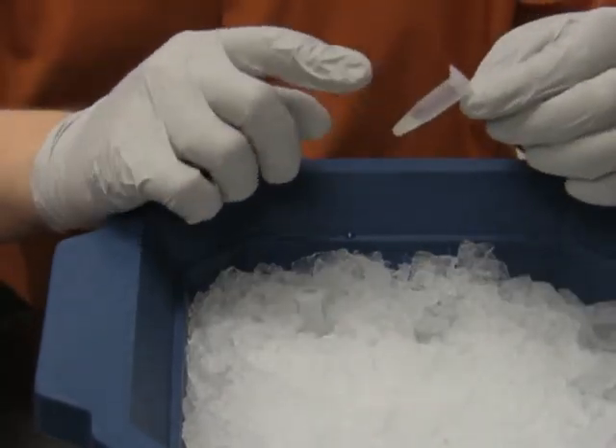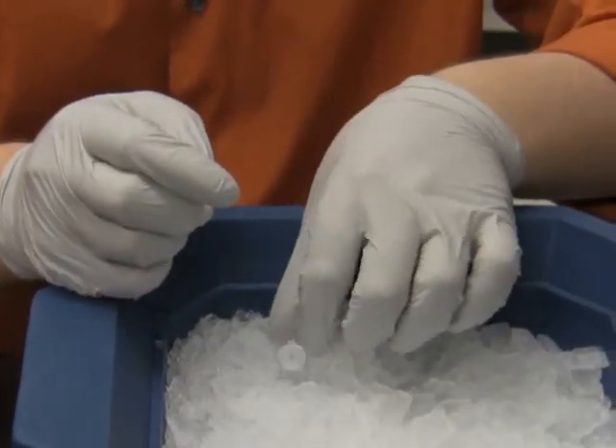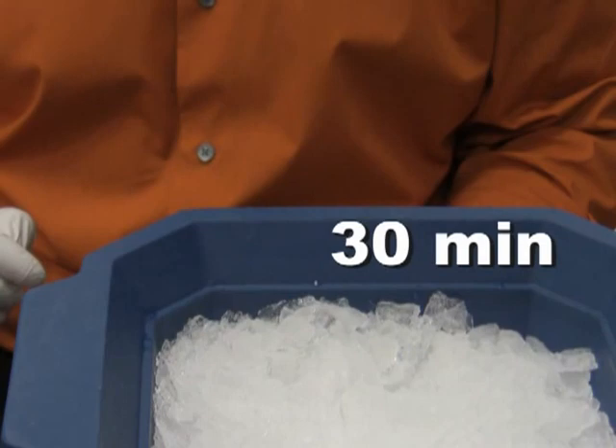I mix the DNA with the cell suspension by gently tapping on the tube. Then I put the cells back on ice and leave them there for another 30 minutes.